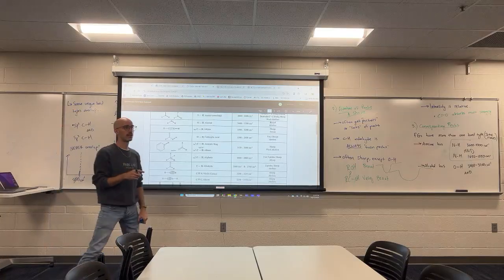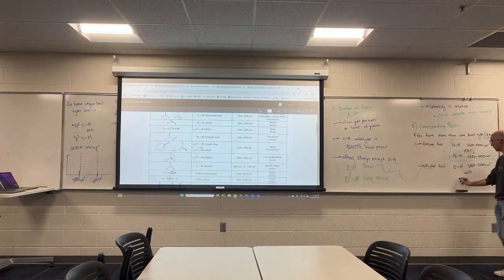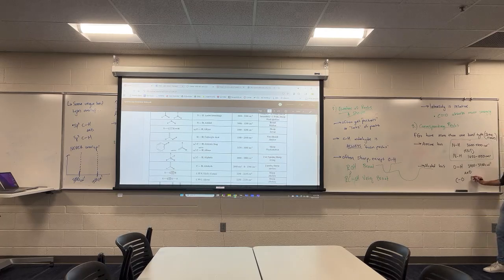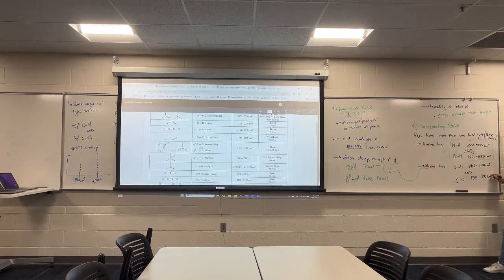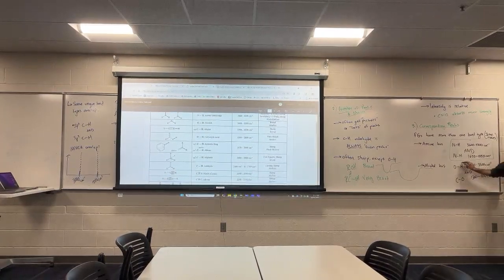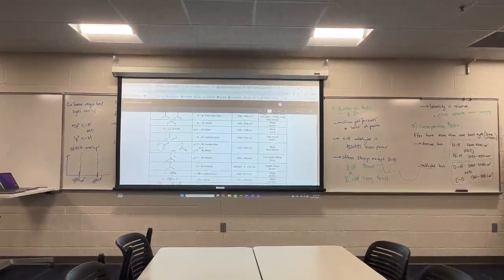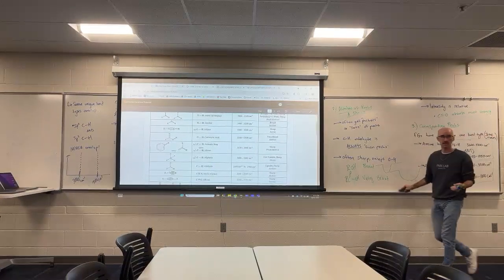If I have the OH absorption of an alcohol, then I must also have the what absorption of the alcohol? The CO absorption. Where is the CO absorption? It's in that fingerprint region, 1300 to 1000. So the fingerprint region, it's going to be hard for me to say with certainty which absorption down there is the CO absorption, but it must exist.